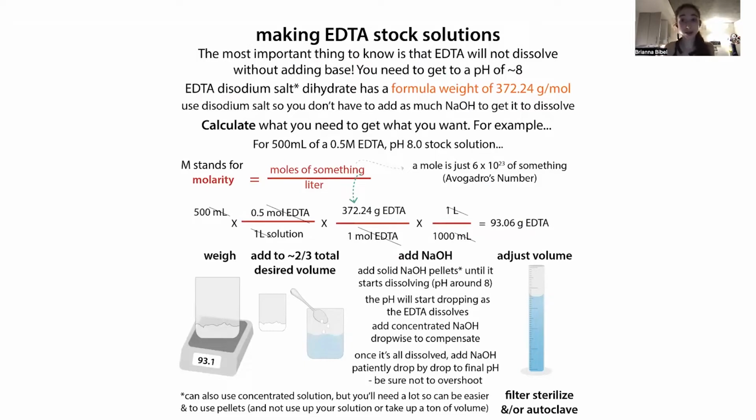So when you're choosing what concentration to do for a stock solution, typically the best thing to do is just Google it and see what people normally make. You can also check the solubility limit, and then you want to make something that's practical and easy to work with. You could make a 0.473 molar or whatever, but that would be a pain to calculate with. Often you want to use what people normally use because that's probably best. And then if recipes call for it, you have it. So anyway, I like to make a 0.5 molar solution at a pH of 8.